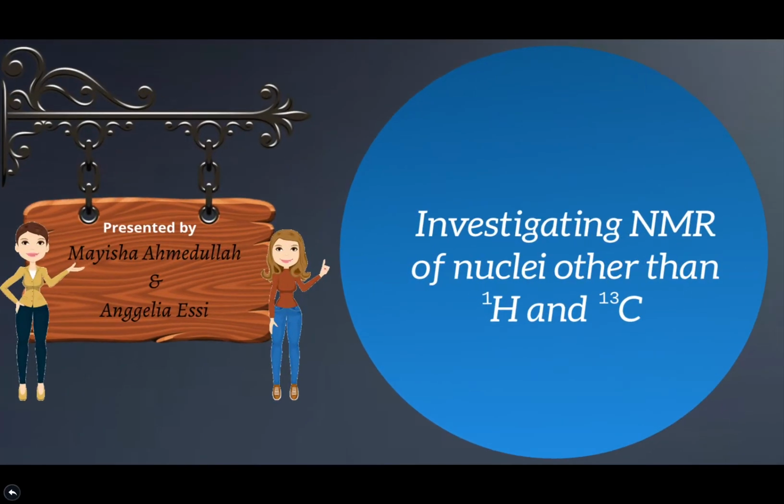NMR, or nuclear magnetic resonance, is a spectroscopic technique which allows for molecular structure determination along with sample identification and purity analysis, among other things. Although both proton and carbon-13 NMR are more commonly used, NMR of other nuclei are also routinely conducted. In this video presentation, we will further explore the concepts behind NMR spectroscopy of nuclei other than proton and carbon-13.